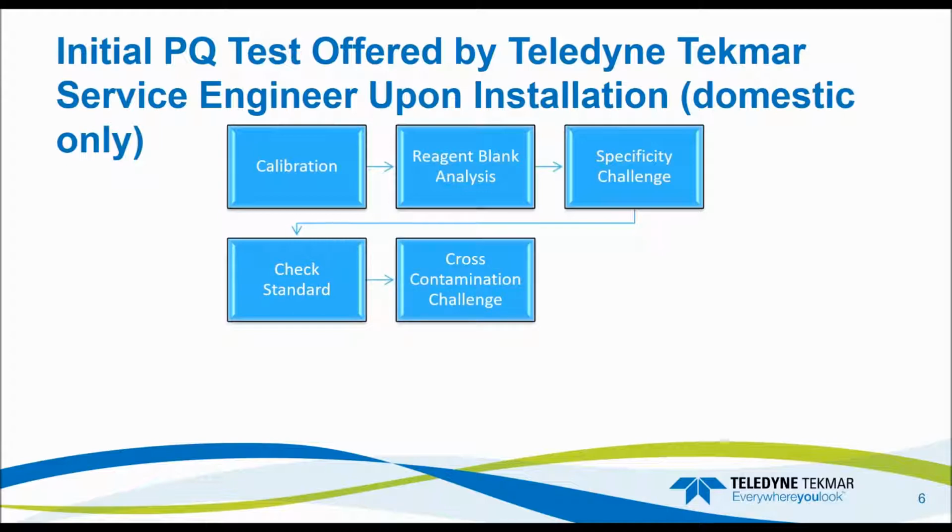They do a cross-contamination challenge, which is basically they run a reagent or a DI water sample after a high-level standard, and they see how much is carried over into that water. And then they do a LOD-LOQ test, which is limit of detection and limit of quantification. So that is a theoretical value. For this test, they run 7 replicates of a reagent blank water, and then they apply that T value.